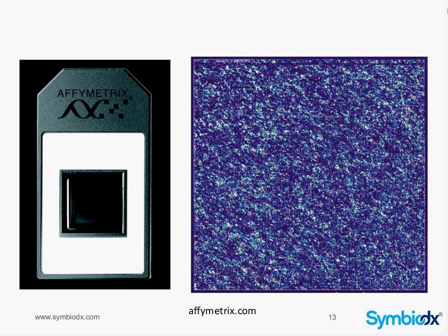After the sequence of the human genome, lots of technologies emerged on the market to try and capitalize on this information that we now had. The most well-known of these is probably the Affymetrix array. The way this technology works is that there are lots of oligonucleotide probes fixed onto a chip, and then we have labeled DNA or RNA fragments that hybridize to these oligo fragments, and you can see if it's hybridizing more or less, and you can actually measure these fluorescent signals.